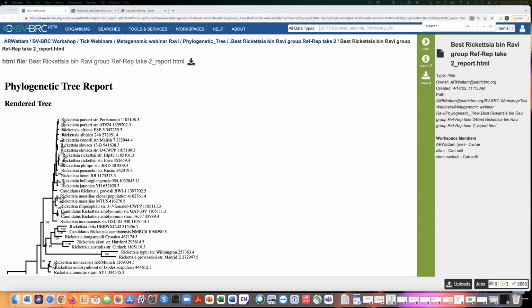One is about using 16S amplicon metagenomic sequencing, again from Claudia: can she build a tree based on those, and can she get any functional predictions from the 16S? The quick answer is that if you're sequencing 16S, then you're limited to 16S. You can build a gene tree with 16S data, but it would have to be annotated within the system. So I would have to go into those genomes and click on, well, I can show you how I would do it.